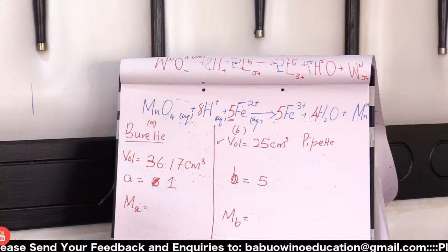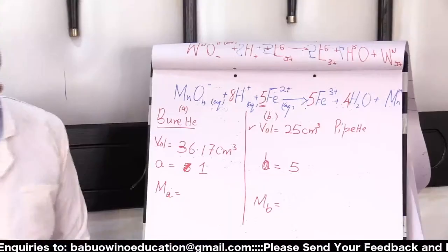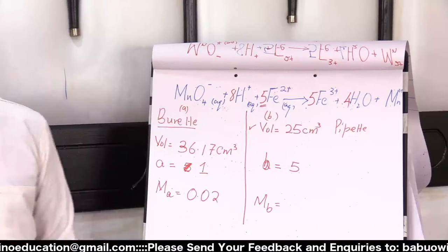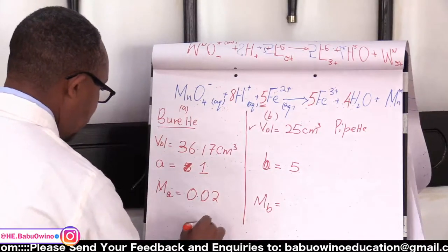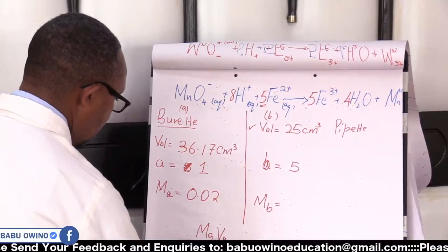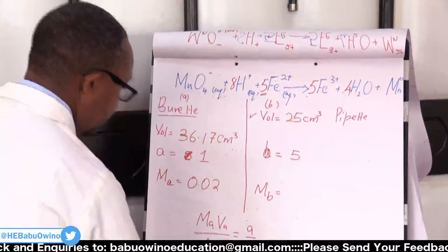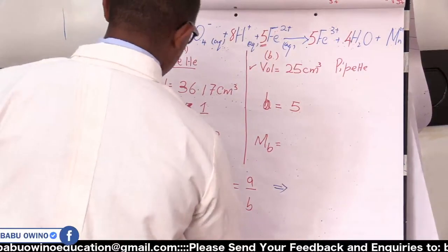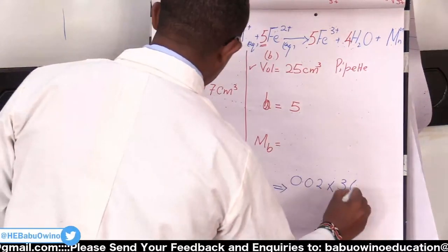Depending on the information given here, we can work out here. For instance, the information we were given by the examiner is that this burette value was 0.02 molar. So simple exercise. Don't worry. It is MA VA over MB VB, and this gives you A over B. MA is 0.02. VA is 36.17.